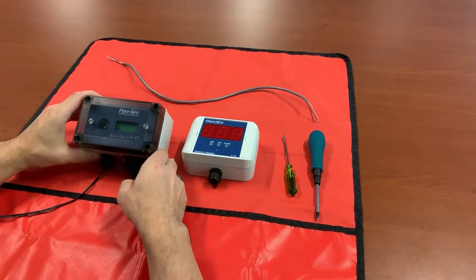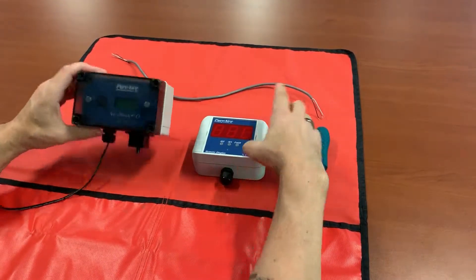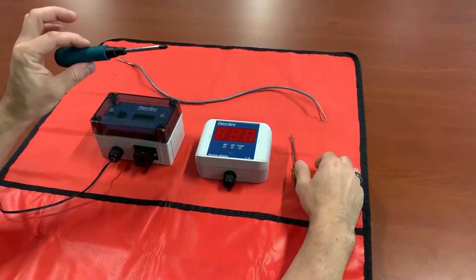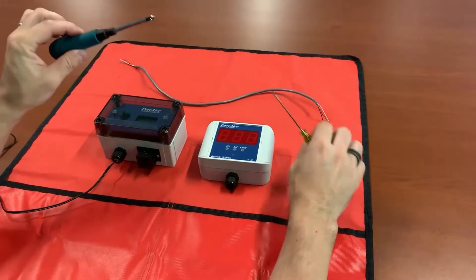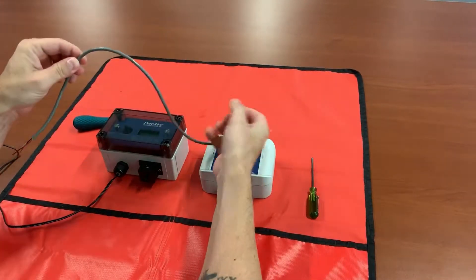Welcome. In this tutorial I'm going to demonstrate how to connect a remote digital display to your oxygen monitor. The only tools you'll need are a number two Phillips head screwdriver, an eighth inch flat tip screwdriver, and whatever length of hookup cable you're going to be using.